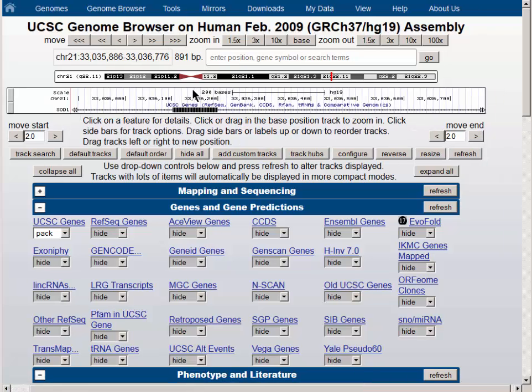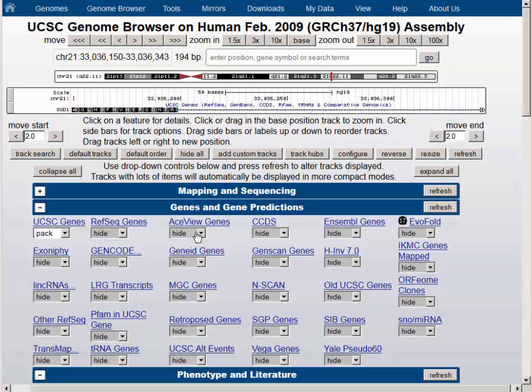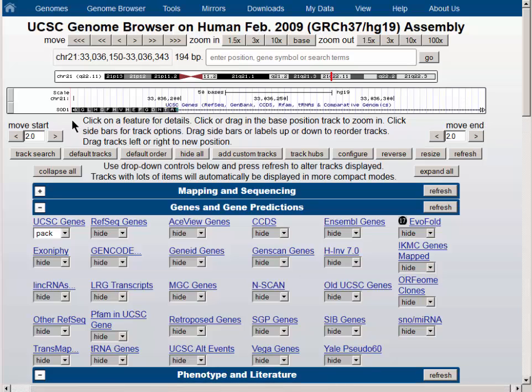It's a little bit more complicated if you are in the middle of an exon, such as this demonstration right here. At this resolution we can see the amino acid names, and once again on the right-hand side of the screen the next exon is number three out of five. However, because this exon actually runs off the screen, when you put your mouse over the arrow it tells you that the next exon is two out of five. The best way to think about this is that it's pointing to the next edge of an exon — if you're in the middle of an exon, it will point to the end of the current exon.